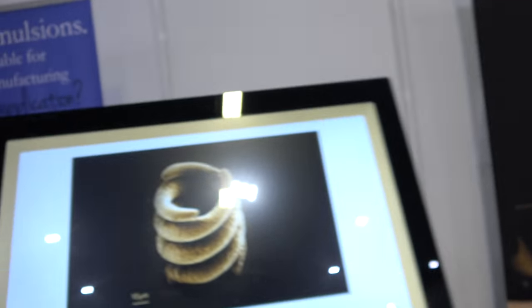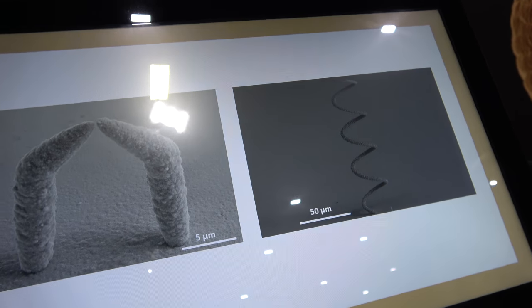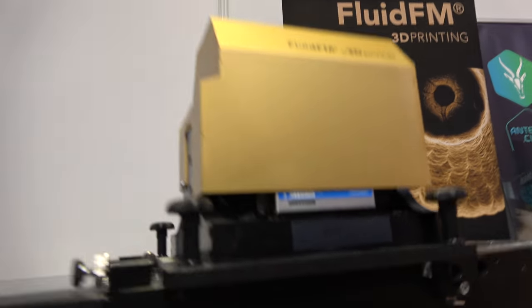It's also on the screen — it's actually this one. It's a helix, a fairly complex 3D object with a diameter of 20-30 micrometers. It's proof that we are able to print metal as 3D objects, because a triple helix is one of the most complex things you can print.